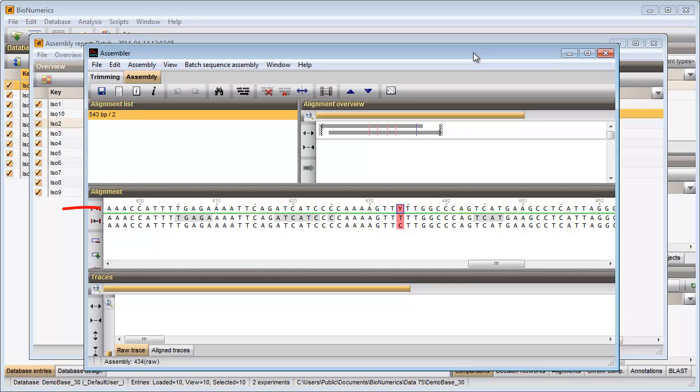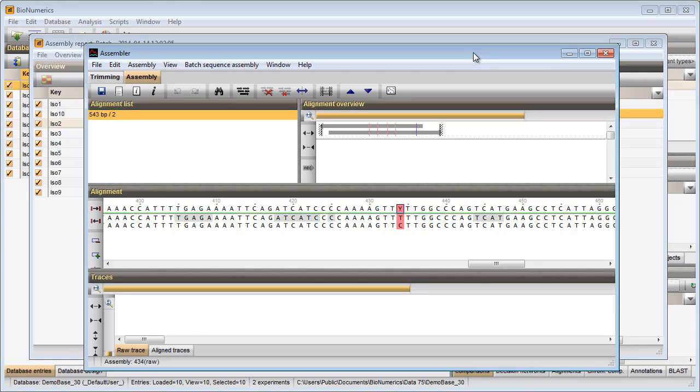The consensus sequence is shown in the upper line. The individual traces that contribute to the consensus are displayed below. Different calls at the same position results in five unresolved bases in the consensus sequence.